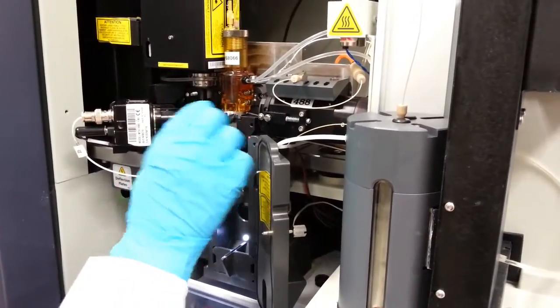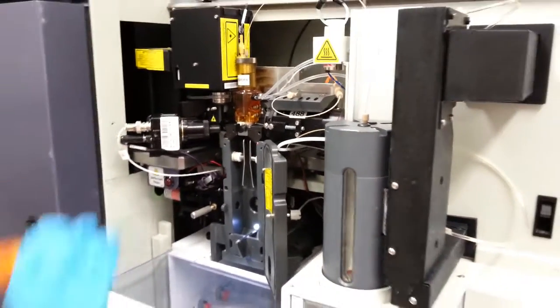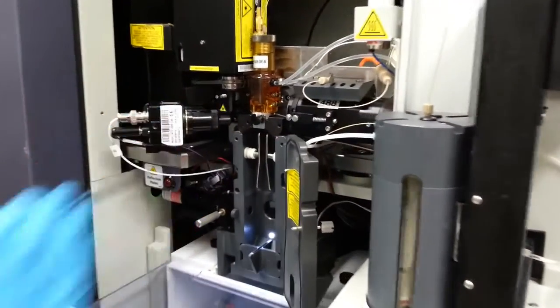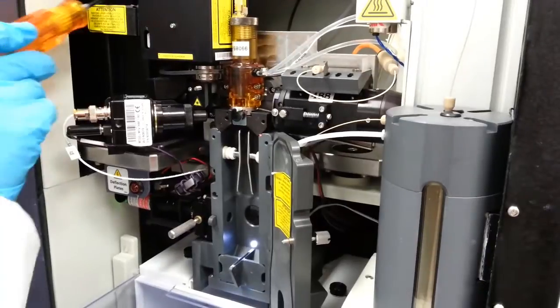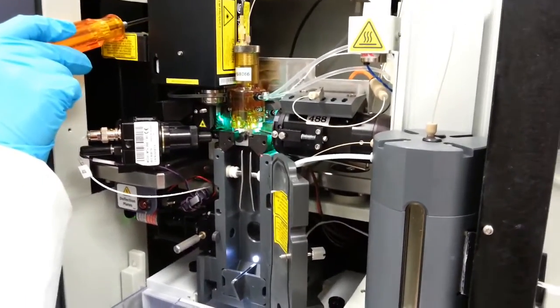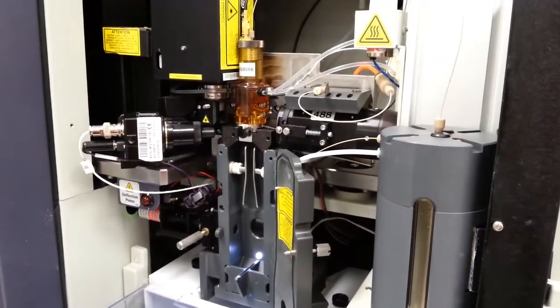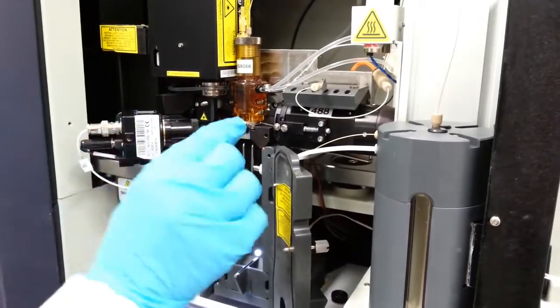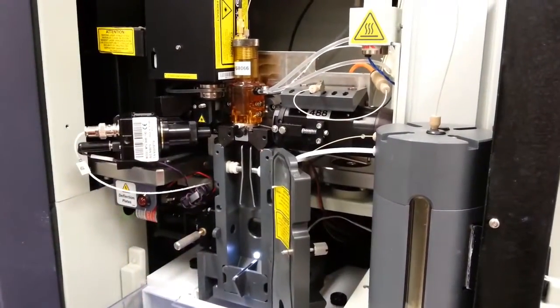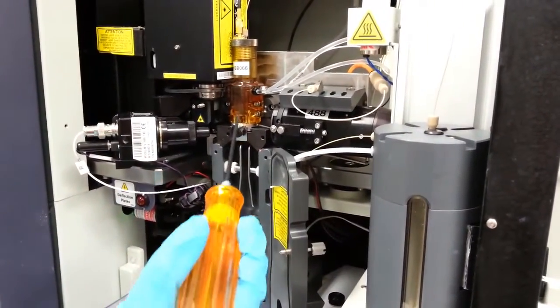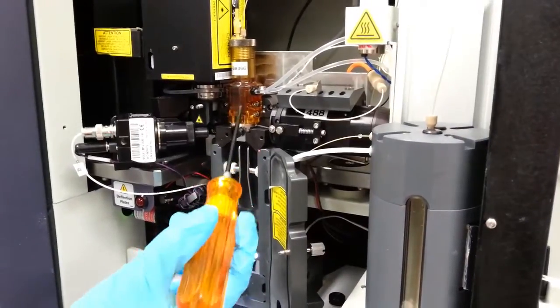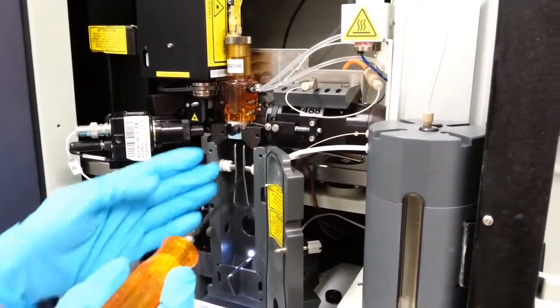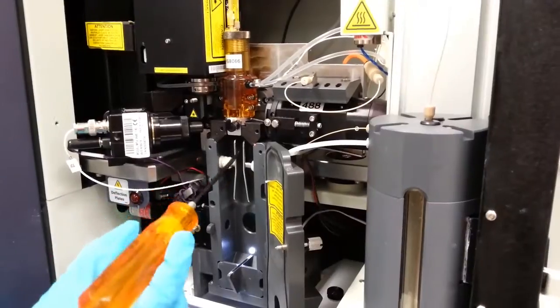As the cells are passing through this flow cell, right here, you've got a whole bunch of lasers. I'll just demonstrate the lasers, that read the cells as they're coming through in single file, and then as the cells are passing through, they exit through here.